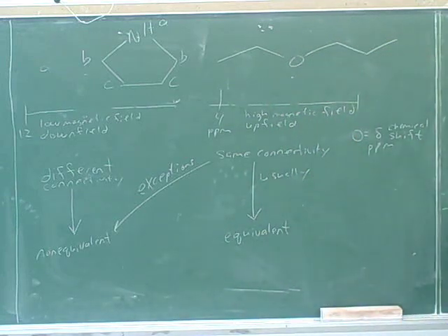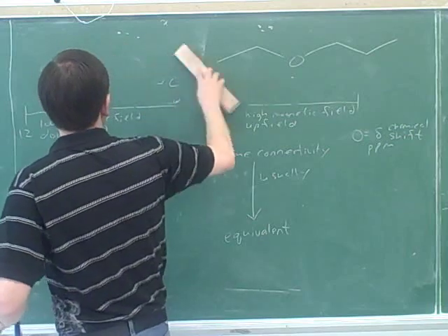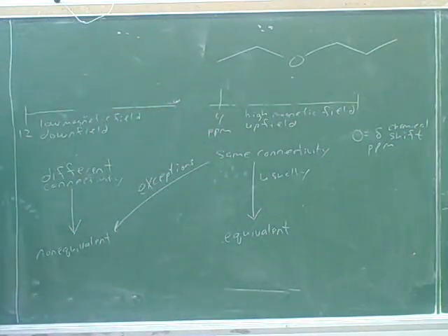Let's identify how many peaks here. Okay. I would put the carbon on the far right. Go ahead and put in your letters.